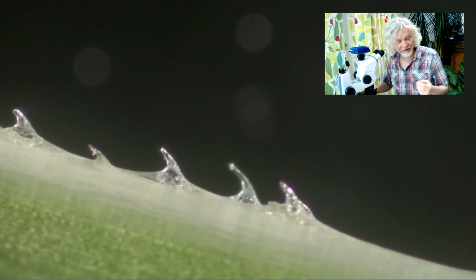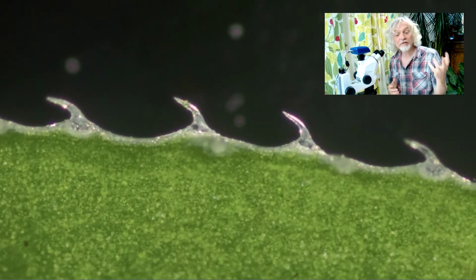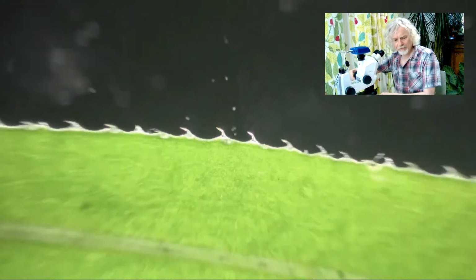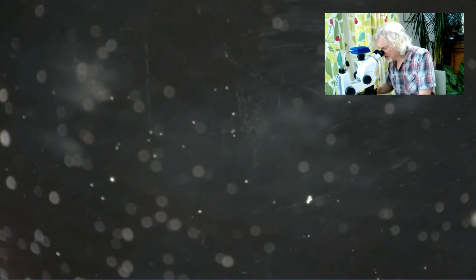Let me show you what a leaf looks like. So I'm going to grab a leaf here. This is a big leaf. And pop that on the slide here. And if you look along the edge of the leaf there, look at that. Aren't they amazing? Beautiful hooks. So that's the very edge of the leaf. If I turn the leaf on its side, I'm going to zoom back out a bit. You can see this bit. This is a bit tricky.